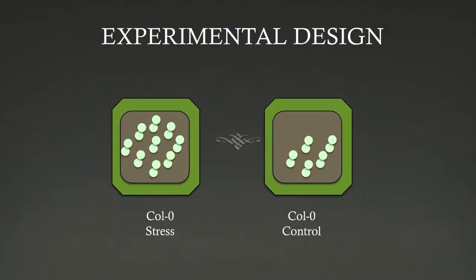As the seeds germinate and grow, you may notice uneven number of plants between your trays meant for a stress or control treatment. Depending on the size of the differences, you may choose to transplant seedlings to make the number of plants in the same genotypes more even across treatments.